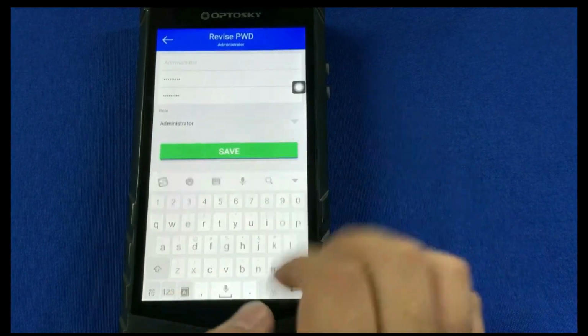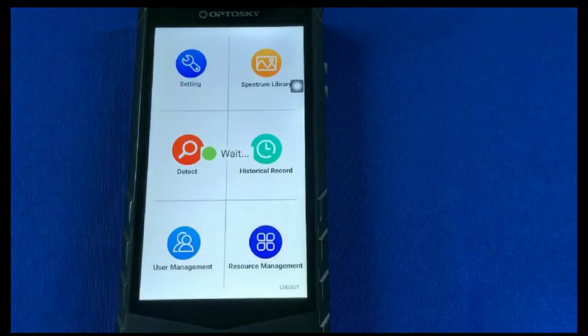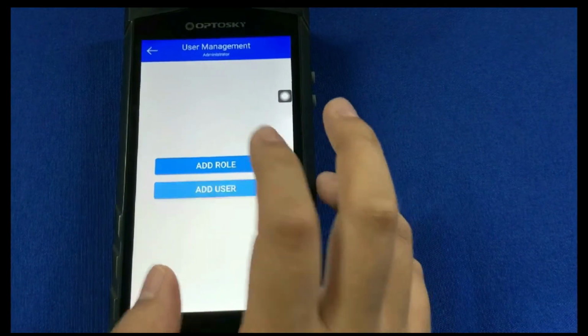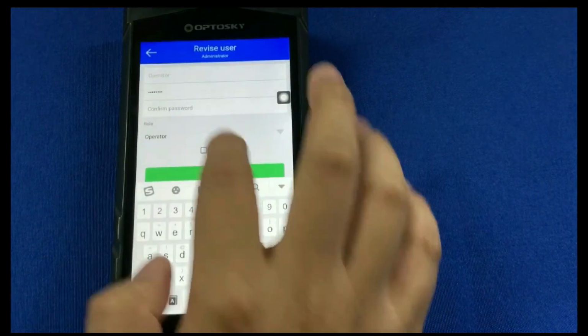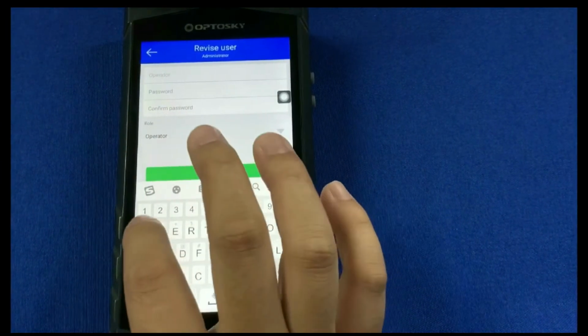Here, you need to reset the password, and the administrator is successfully created. Secondly, we will perform test case 4 to change the account password.